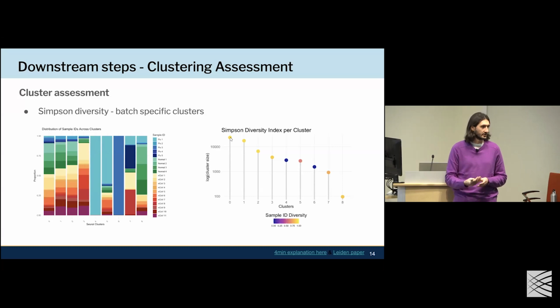I would interrogate it and be like, what genes are differentially expressed? Do I see this in my condition of interest? Because if I see this cluster just in one of the patients, but it's, let's say, in my disease category, then I might be more inclined in keeping it to be like, oh, this seems to be something that's more disease specific.